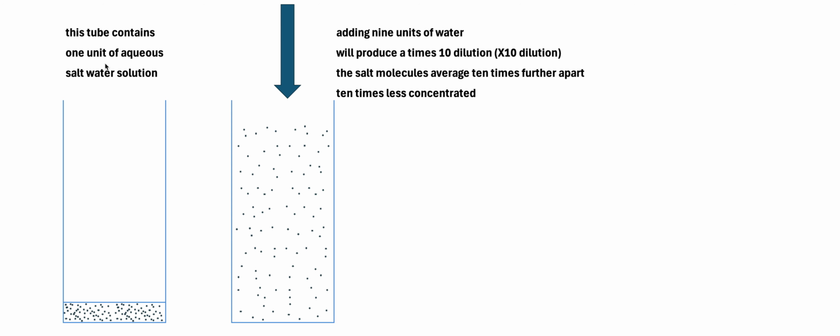This tube contains a unit of aqueous saltwater solution. All the salt is down there in water. And then a bunch of water was added. 9 units of water were added right here, 9 times as much water. So the amount of water here is about that same.